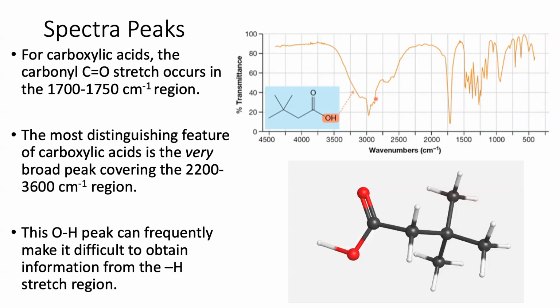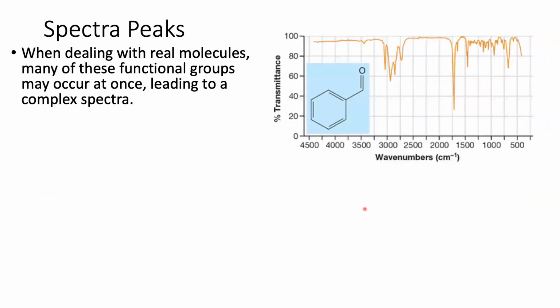Because again, more broader spectrum are often dealing with molecules that have good intermolecular forces, and that hydrogen wants to go places. Now, let's take a look at what real molecules look like. So far I've been looking at molecules that mostly have one, or depending on how you count it, combining an OH with a carbonyl, two functional groups. Real molecules will often have much more.